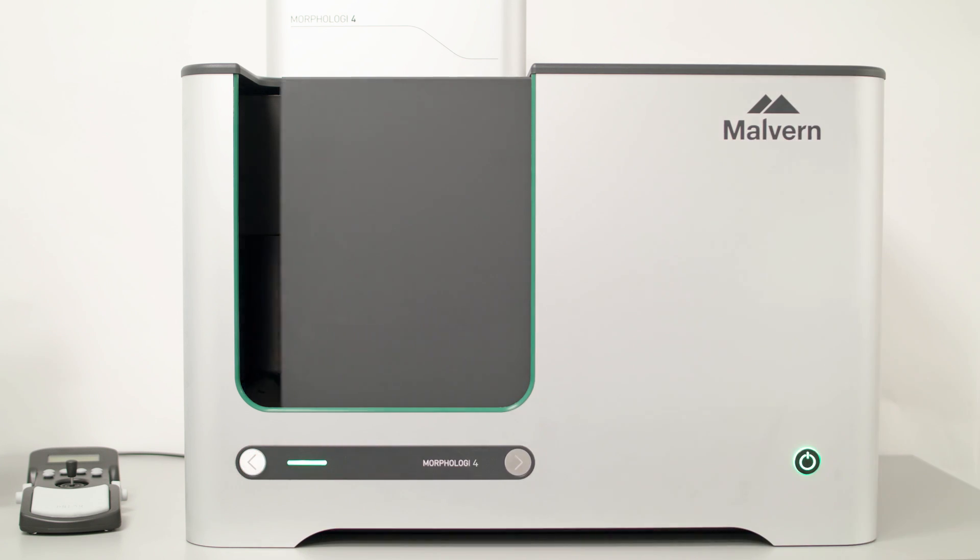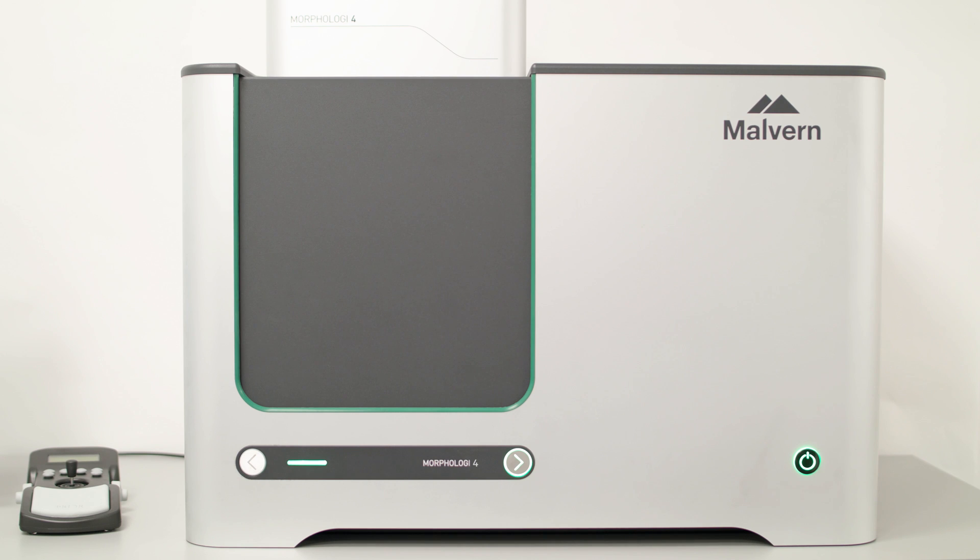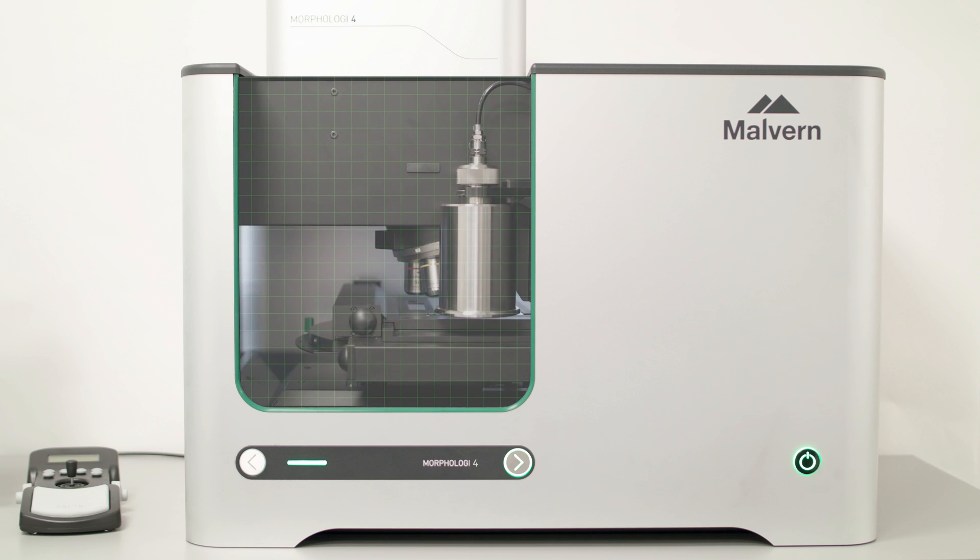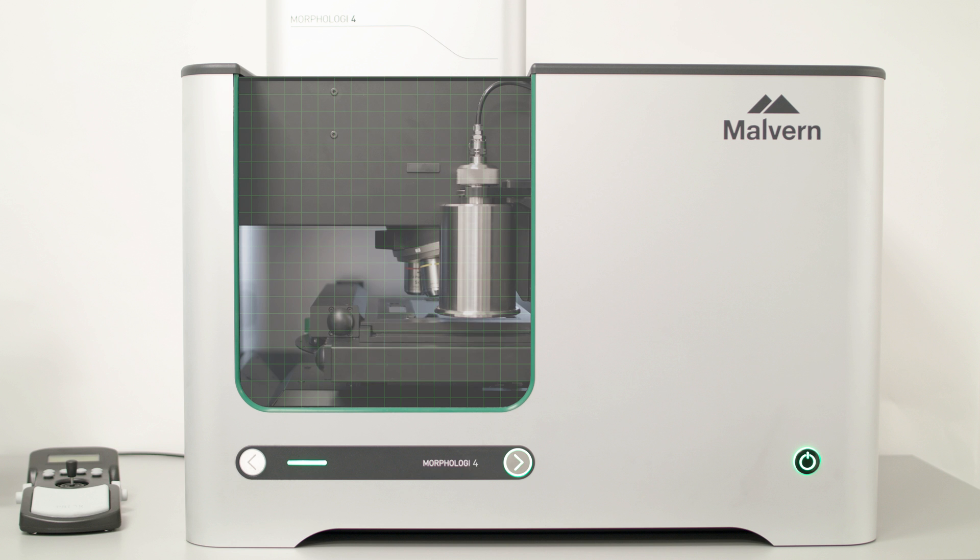By providing automated, rapid, quantitative morphological descriptions of your samples, a deeper understanding of your materials and greater clarity of your process can be quickly attained.